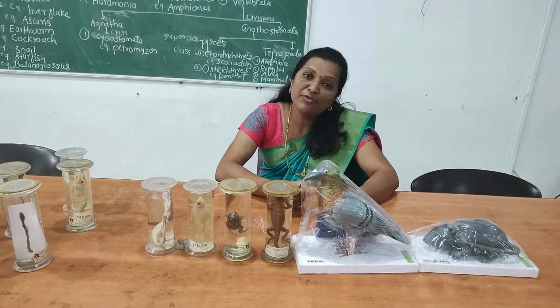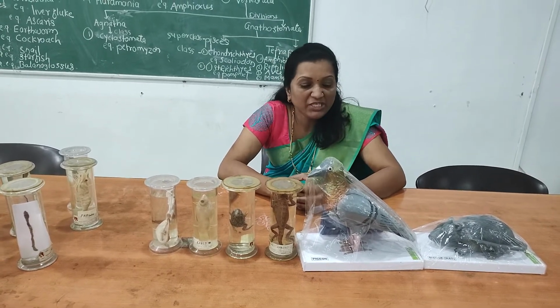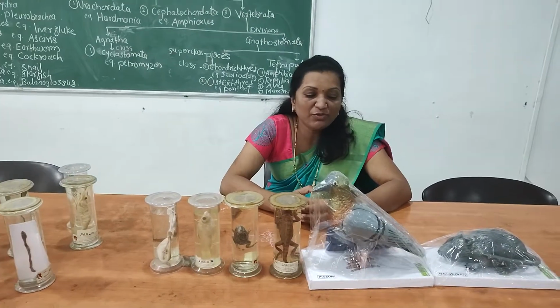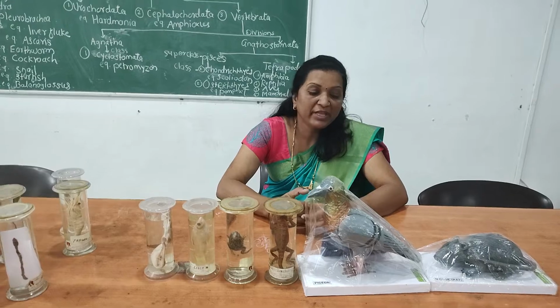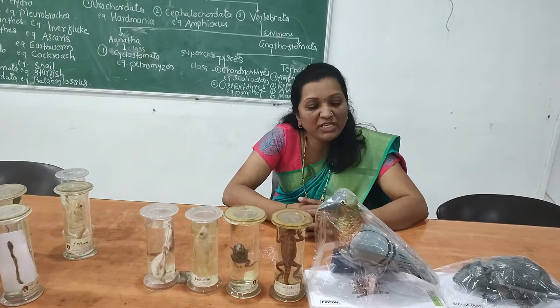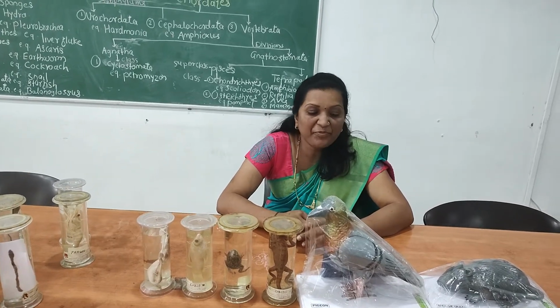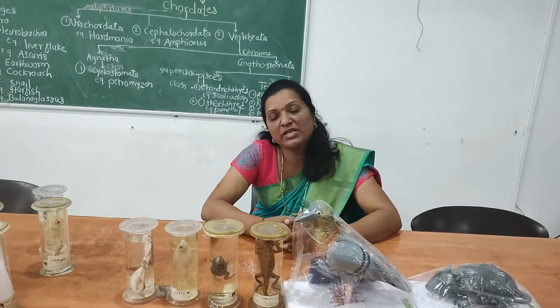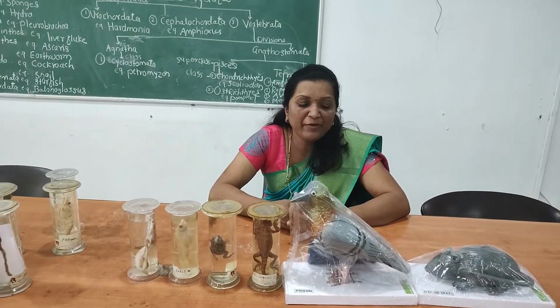Then they have the caudal fin, which is used for changing direction during swimming, and they also have paired fins for swimming. Their exoskeleton is in the form of dermal scales, that means scales are present on their skin. The endoskeleton is either cartilaginous or made up of bones.